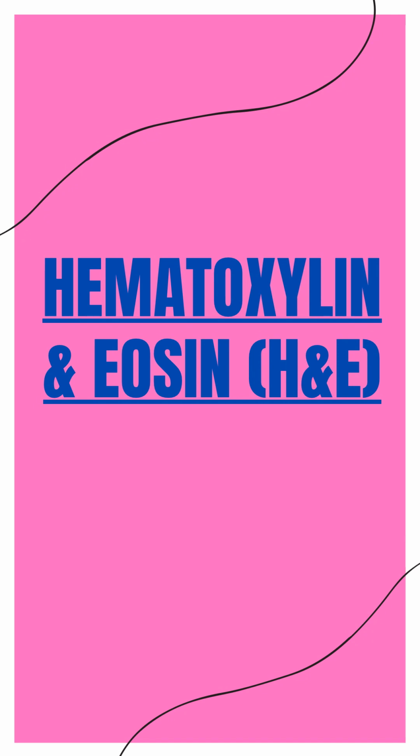In histological preparations, eosin is attracted to eosinophilic components, which typically include the cytoplasm of cells. This staining property helps to highlight cellular structures and differentiate them based on their affinity for eosin, allowing for better visualization and analysis of tissue morphology.